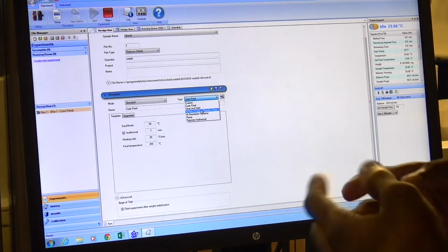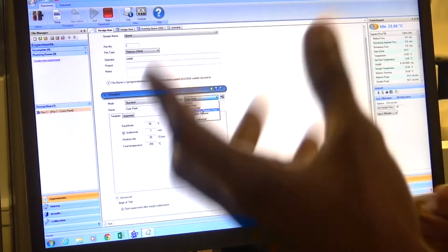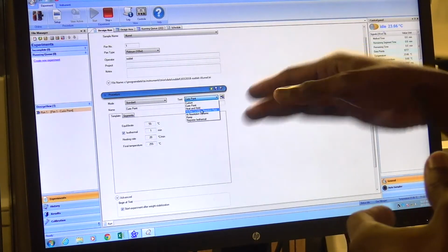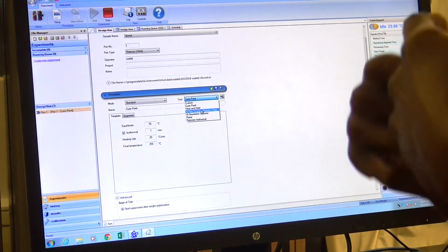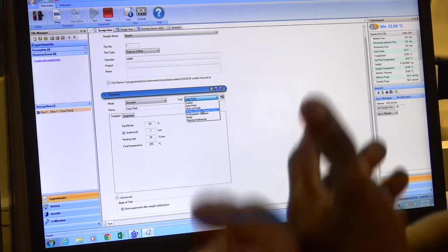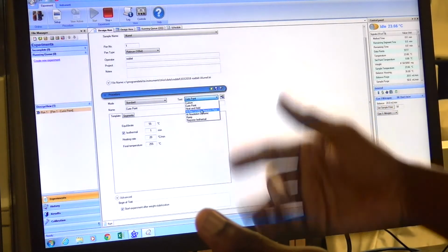is going to take. The high resolution modes allow you to shrink that time by varying your heating rate based on certain parameters. So when you go into high resolution mode, you set a default or a baseline heating rate, but then once the instrument detects a certain amount of mass loss, it slows it down and allows that process to continue to completion. And then when it senses that it's relatively finished, it'll speed back up again, right, to that default heating rate.